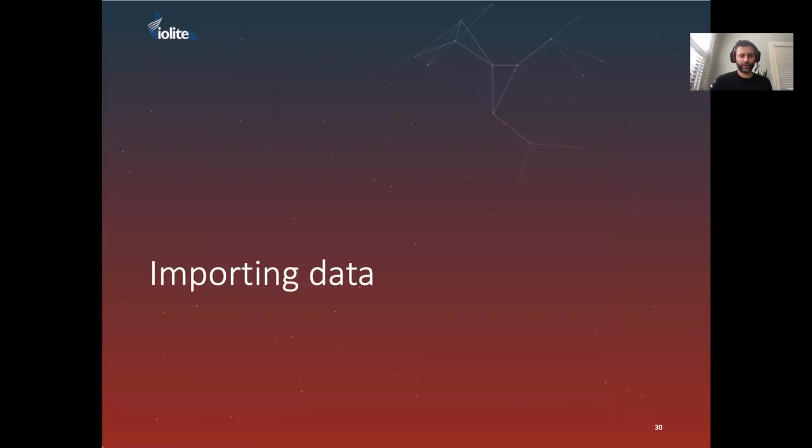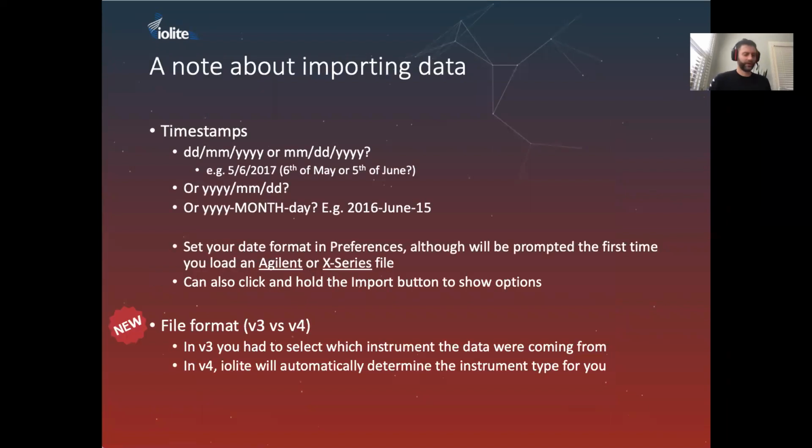Okay, so now we get to the more interactive side of things. So we'll look at importing some data. So hopefully everyone has downloaded the example.